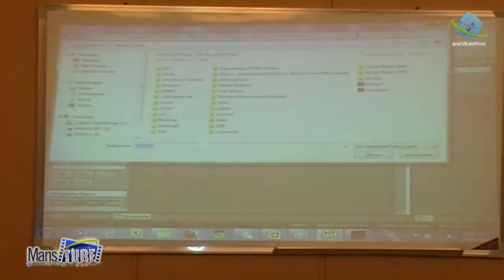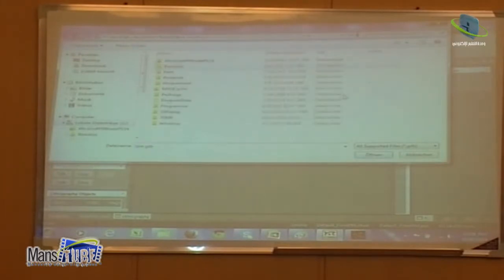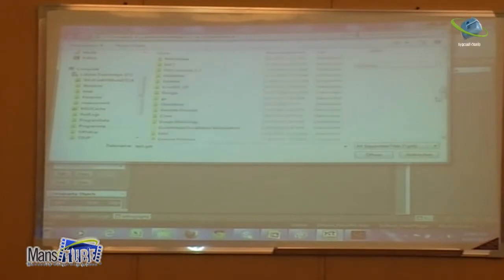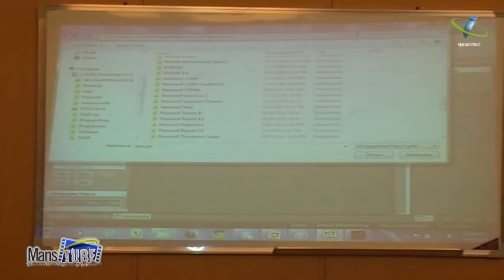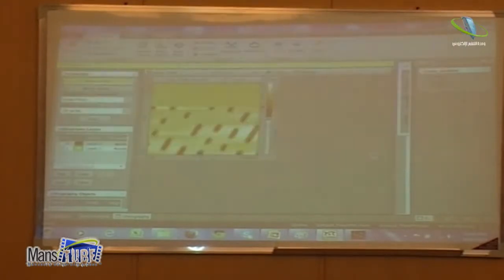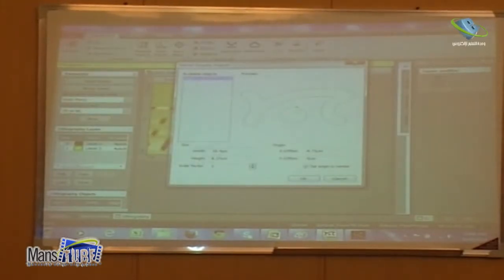I have a special design. Then I go to program. This is NanoSurf software, and then you have a lithography template. You have this logo. Here I put the image size. I make a factor of 0.1, and that is like 1.6 micron, 0.8 micron.